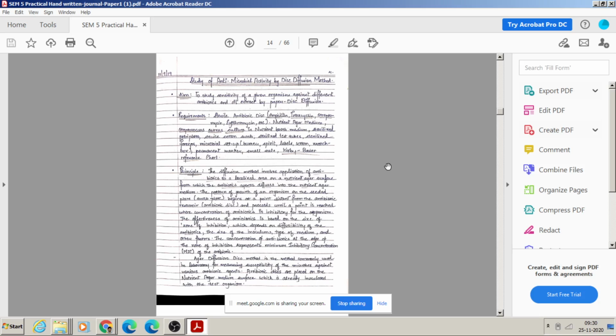Based on the very first practical, you know that a microorganism can be isolated. Now the next part is that this microorganism's activity is tested in such a way that the isolated microorganism has to be brought in contact with an inhibitory compound. Now how is it done? It is done by means of a compound of our interest, which we suspect to have antimicrobial action, an antagonistic compound.